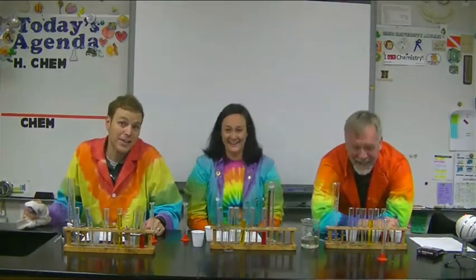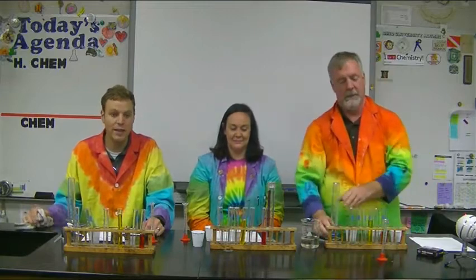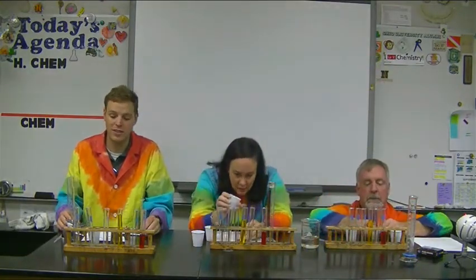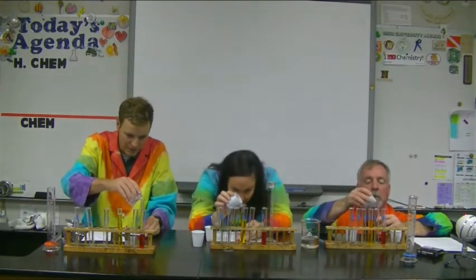Step number 6, put 17 milliliters of the blue solution in test tube E. It's a judgment call. You could use the big guy. You could use the little guy. That's up to you. I'll probably go with the little one since I don't have to fill it up more than twice. I'm going to go little guy too. Me too.